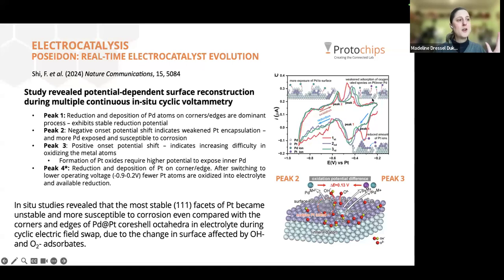It's getting harder and harder to oxidize those platinum molecules on the shell because you're forming platinum oxide over time. And then this peak 4 is actually the first cycle, the tail end where they did that initial higher potential cycle to damage the platinum shell essentially. So this is the residual of that.